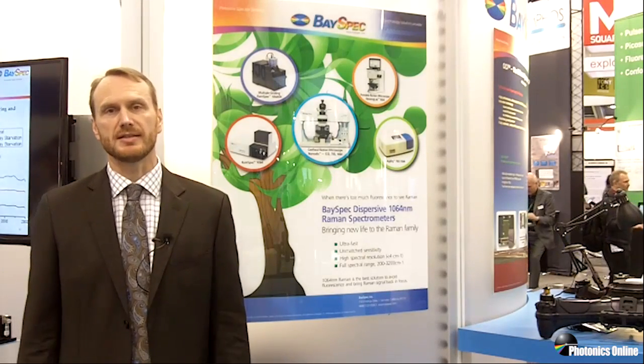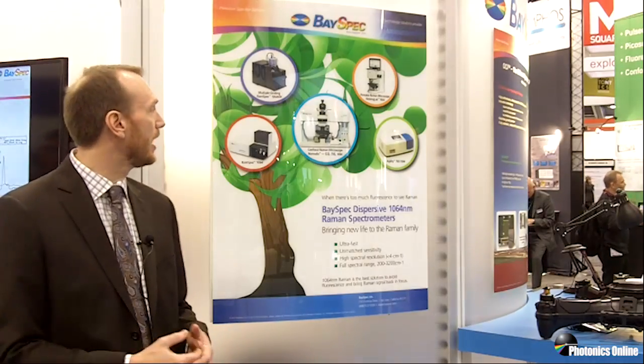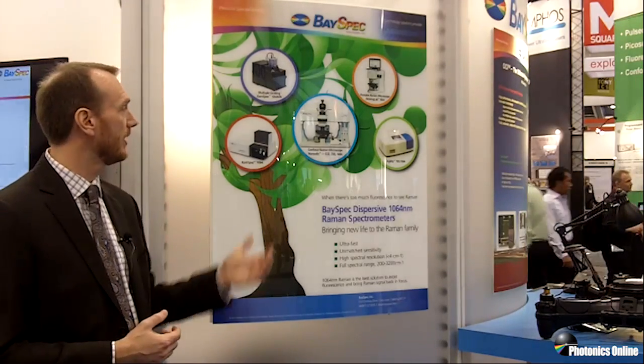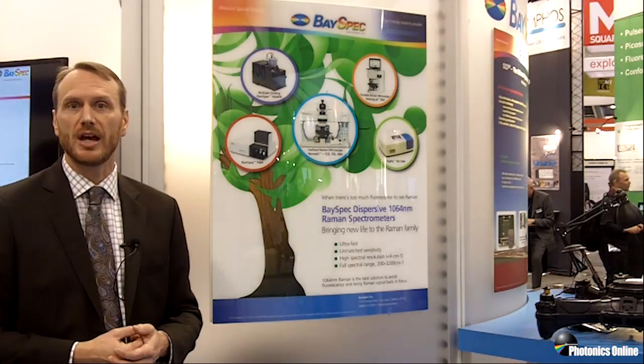The Agility portable Raman spectrometer is just one of a family of 1064nm Raman spectrometers that we have at BaySpec. We also have confocal Raman microscopes, similar to the Agility in that you can do multiple wavelengths — in this case you can do three wavelengths: 532, 785, or 1064.